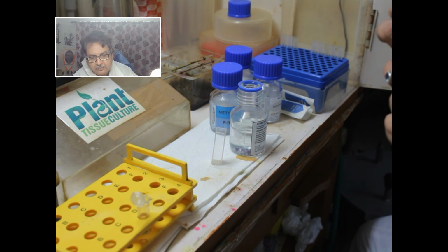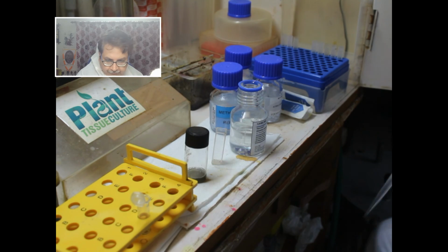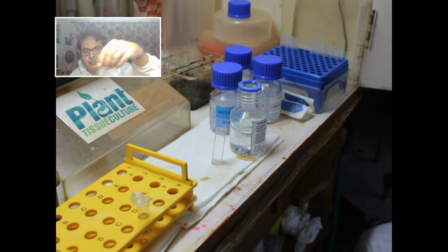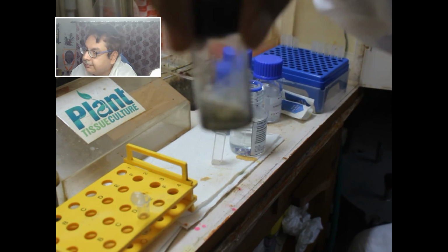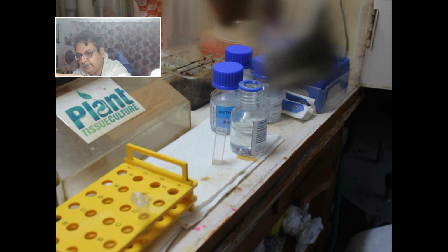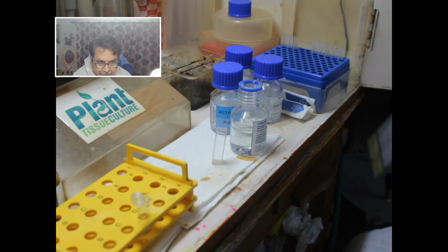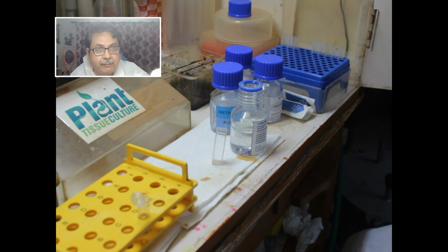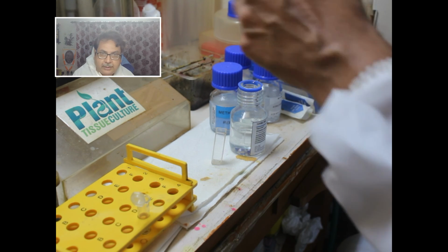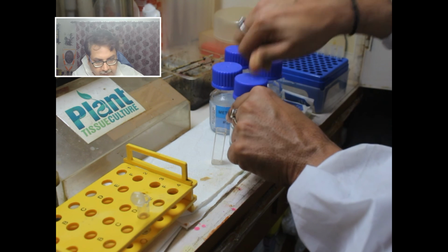Okay, now our leaching solution is ready. So this will go to the spectrophotometer. Here you can see in this camera, this solution is ready, the organic solvent and the fungal base. You have to keep this for 20 to 30 minutes. The longer you keep it, the more the extraction will be.